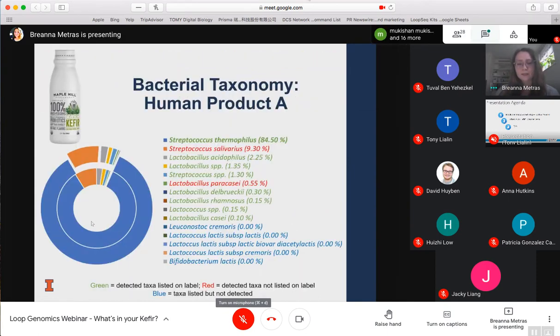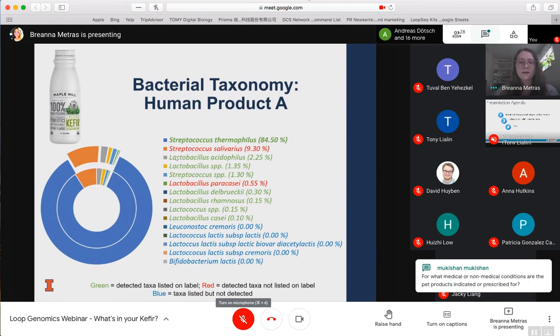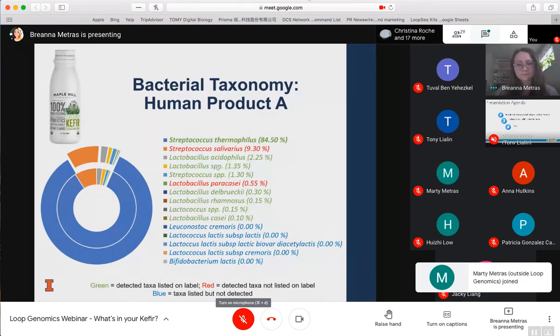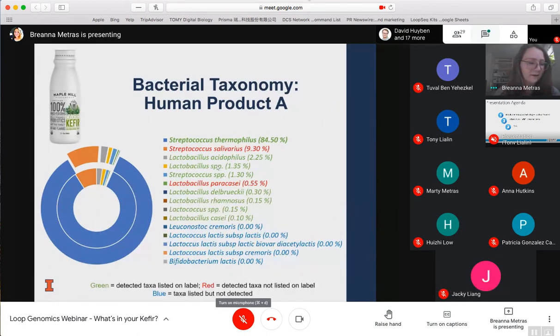So we'll go into some more detail on the human product sequencing. In this Maple Hill, the most predominant strain was Streptococcus thermophilus, and then Streptococcus salivarius and Lactobacillus acidophilus. I would just like to emphasize again that we were only able to get this specific to species due to the long read sequencing. So this is really exciting and new, that we know the species level in some of these commercial products. Again, to note, there's no Leuconostoc found and no Bifidobacterium found in this product.